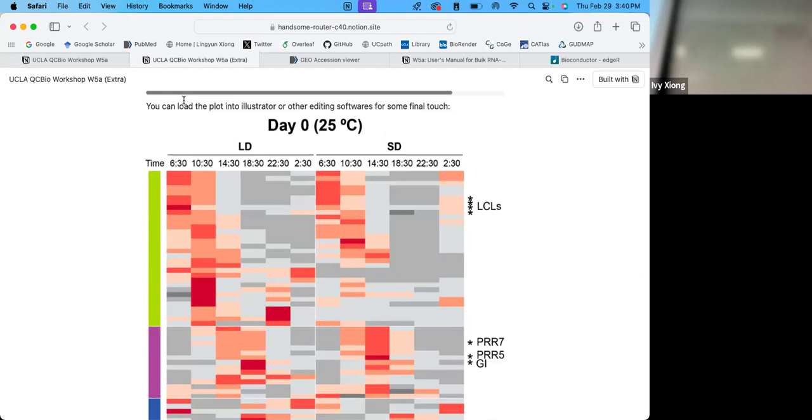It's like, oh, you think something is going wrong, I know how to fix it, I know how to adjust. Right? Because when you're doing data analysis, there's so many parameters you have to change according to your own data set. Yeah, you have to fine tune a lot.